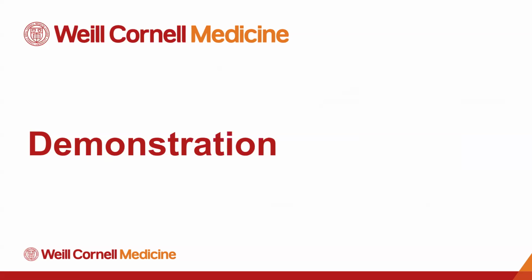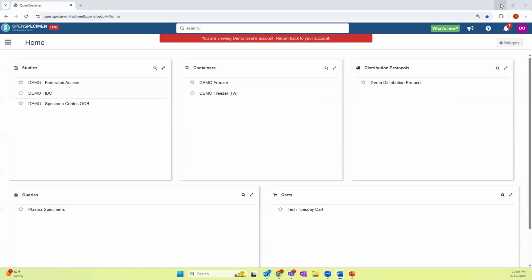Give me one moment. I'm just going to switch over my screen share. All right, you should all be able to see OpenSpecimen now on my screen. So just to give you a lay of the land, and I'm also going to turn off my video as I'm going to start looking at the other screen in a moment here.